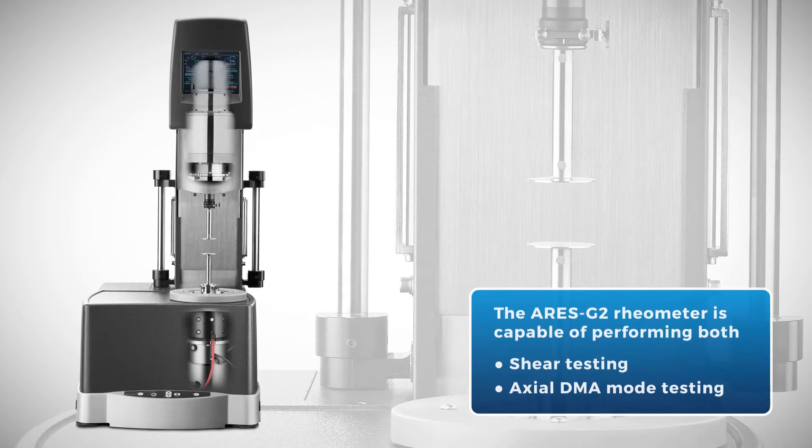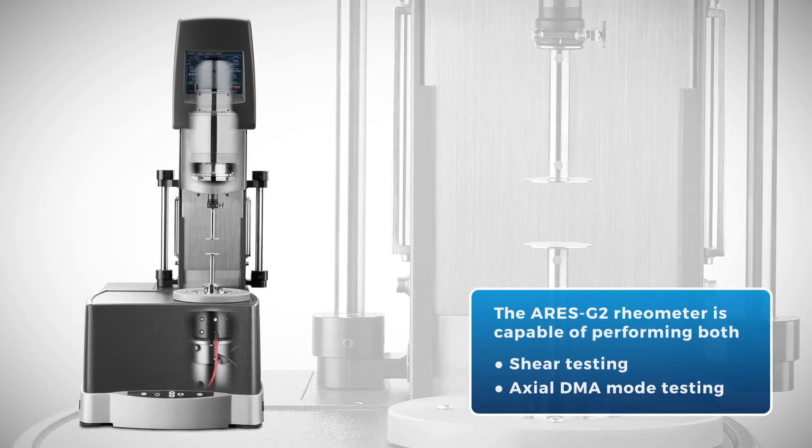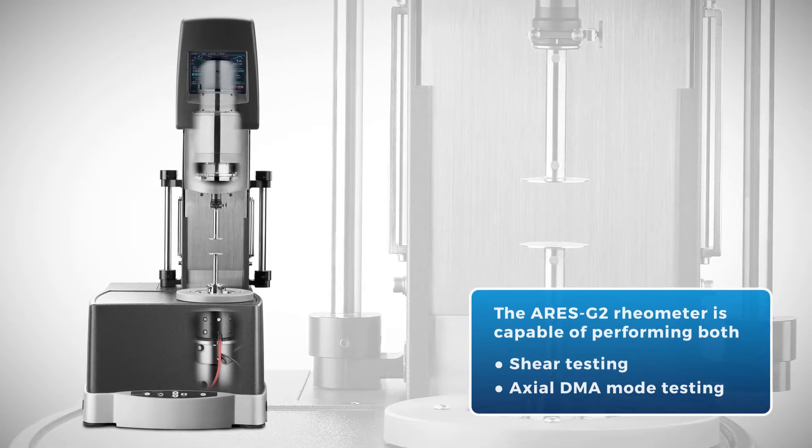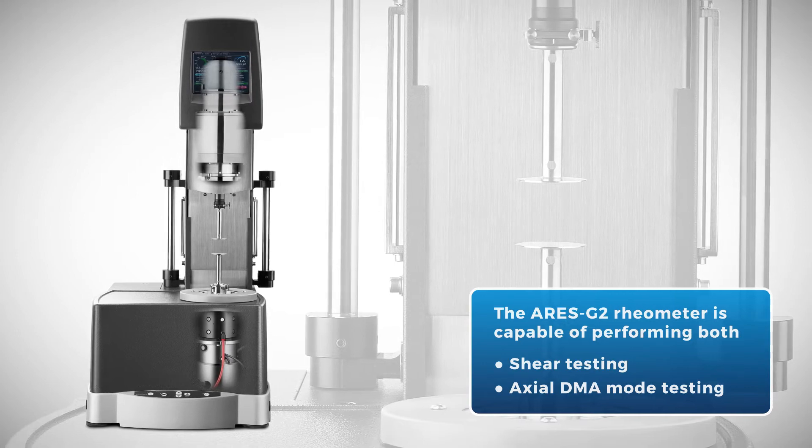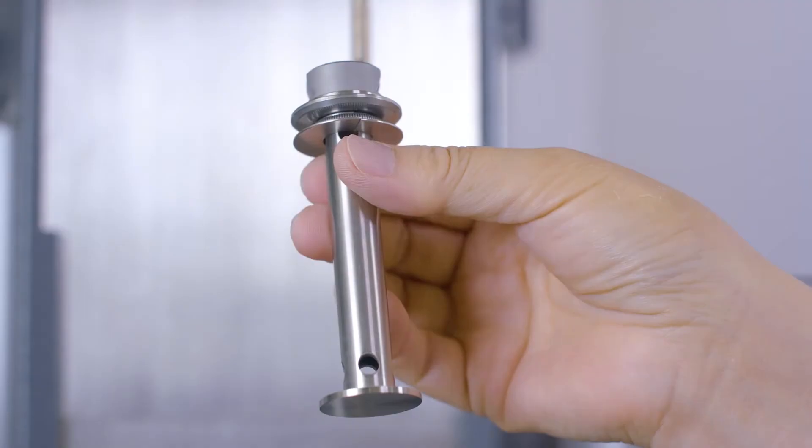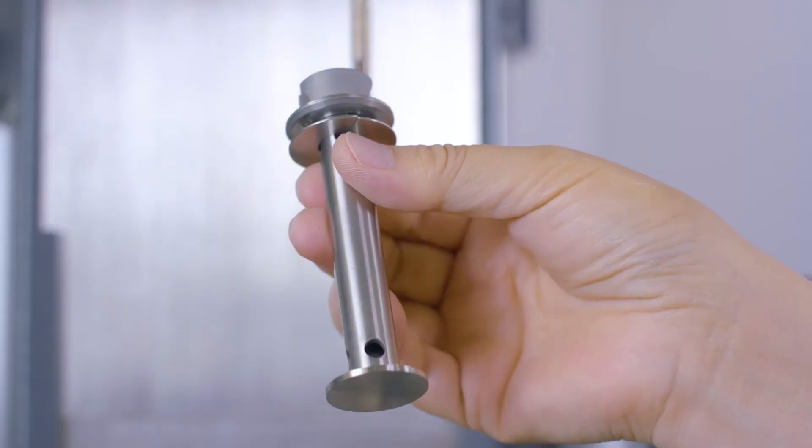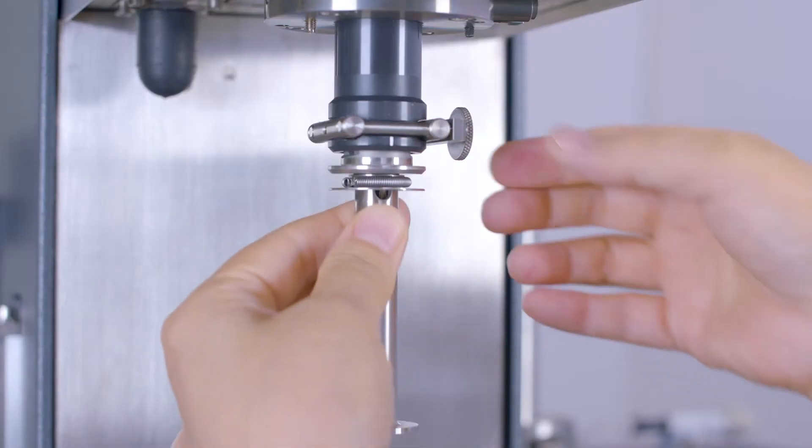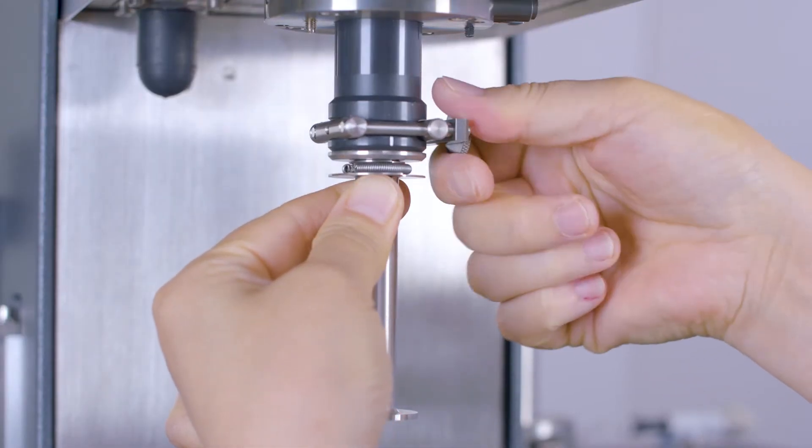The ARIES G2 rheometer is capable of performing both shear testing and axial DMA mode testing on samples. To perform compression measurement, we need to first attach a parallel plate to the instrument.